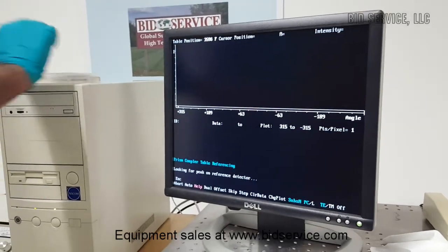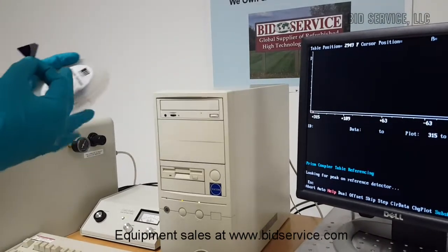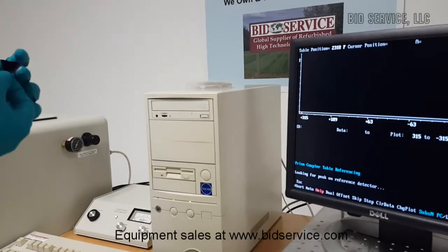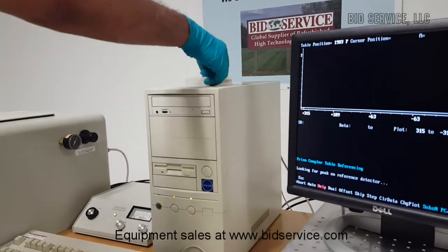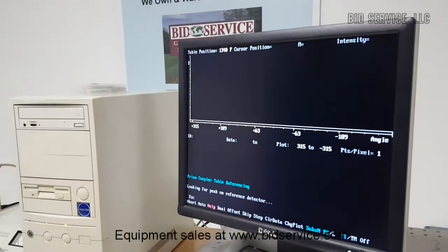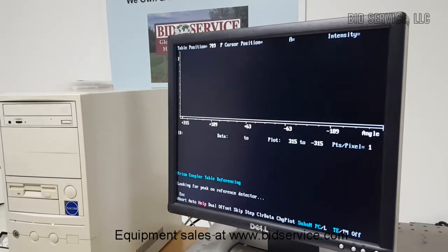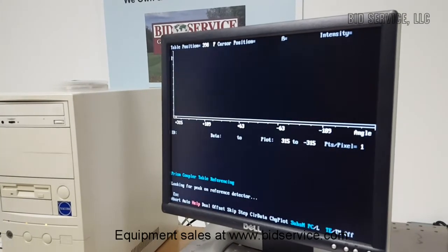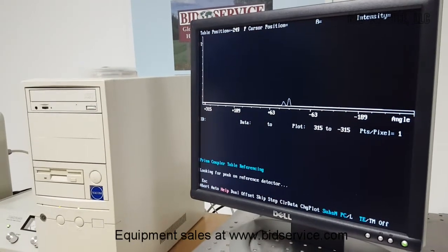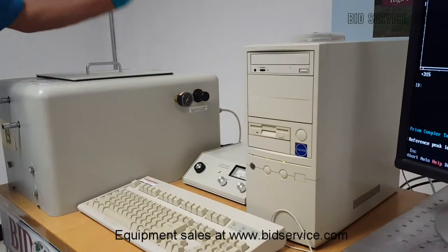So I have a silicon dioxide film on a substrate. The film thickness is about 9,400 angstroms. So this is silicon dioxide on silicon. I'm going to test this sample shortly after this refractive index measurement using the third wavelength, that is the helium neon laser. The diode laser, the IR laser power supplies are inside the cover here, and the helium neon laser power supply is attached to the casing on the back side of the unit.